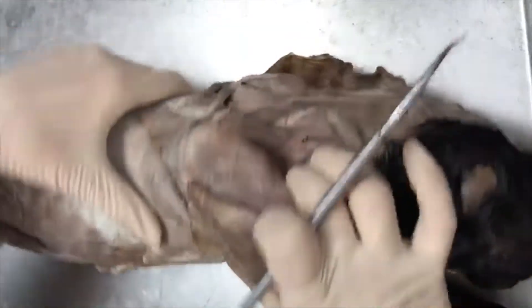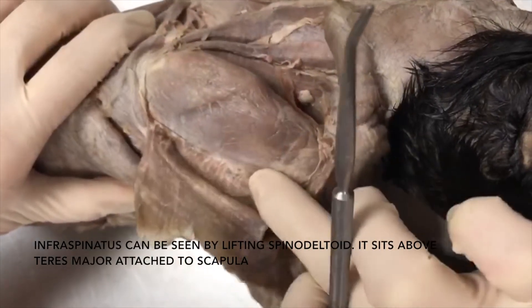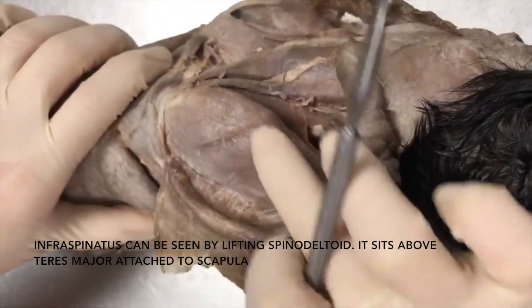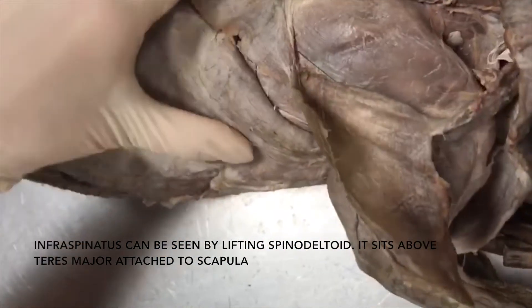If we flip the cat a little more this way, you can feel the spine of the scapula. The area above the spine is going to be your supraspinatus, and the area below the spine is going to be your infraspinatus.